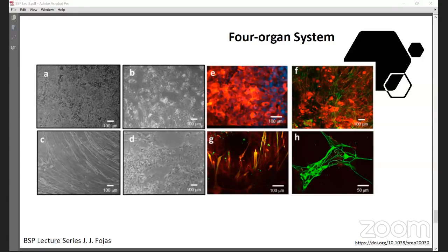So what they did is basically just a toxicity trial. The toxicity trials were initiated after 5 days under flow in the pumpless system and lasted for 48 hours. The drugs were administered through the reservoir closest to your liver. And then the cultures were compared to untreated controls at 7 days in the flow system for both your function and viability.